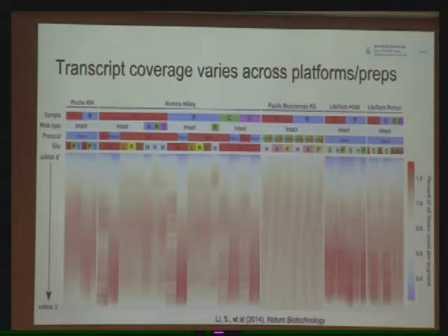So when you did the sequencing, how many reads did you capture from the beginning of it? How many reads did you capture that came from the middle of it? How many reads did you capture that came from the end of it? What this is showing you is that in this case, since it's blue, we have very few reads from the beginning of that transcript. So we can't quantitate the beginning very well. And if we wanted to look at variation in the structure of that transcript at the 5' end, or look at maybe its start site differences, we wouldn't be able to do that very well because there aren't very many sequencing reads from that part. However, we do have good coverage across the middle.